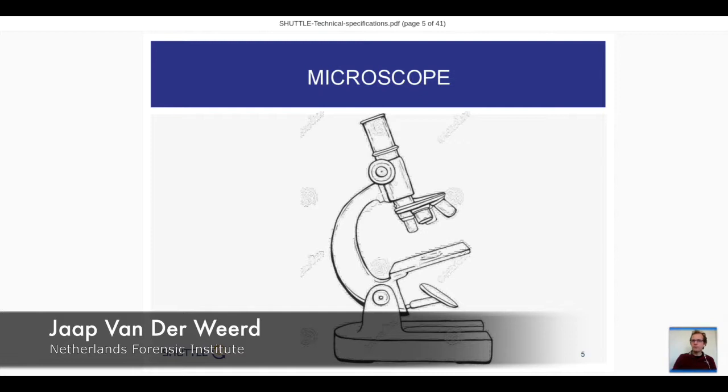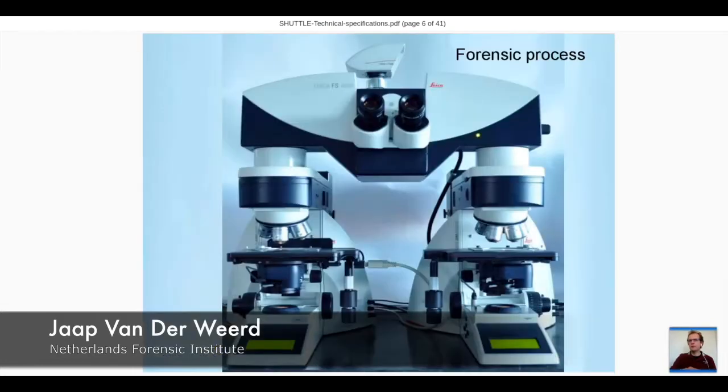And this is a type of microscope within our lab. We do a lot of comparisons. So we have a sample and another sample, and we want to know, are these the same? So we look through a comparison microscope, as you see here, actually consisting of two separate microscopes, and what you see through the oculars is a combined image of both. So there's a gap between what's common practice in forensic institutes, and on the other side, the impression that's been displayed through television series.